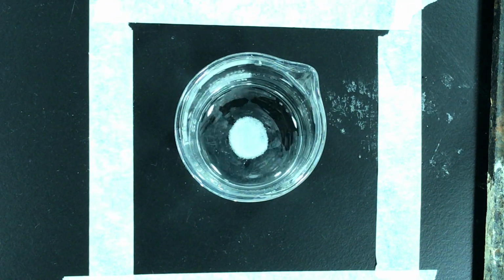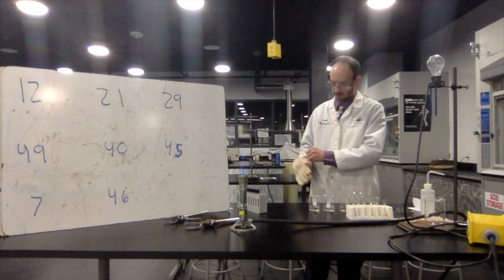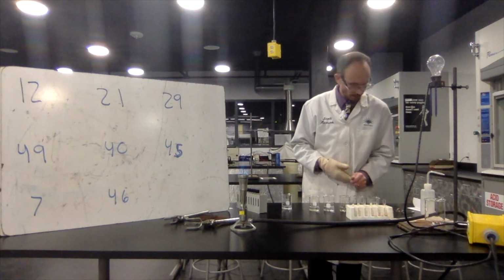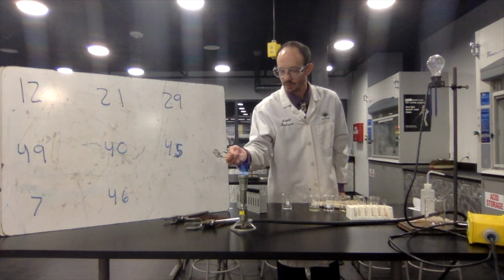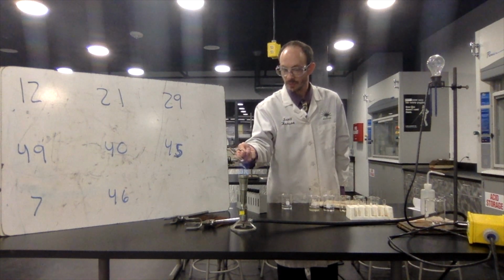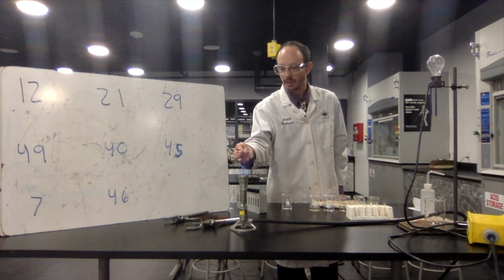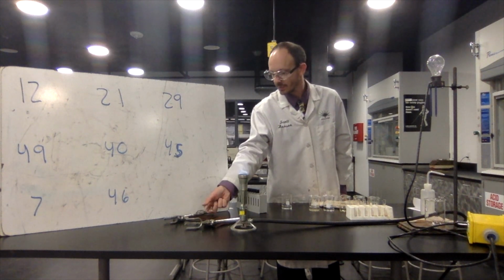So I put a little bit in there, and you can see we still have that same little bit in there. There's been no dissolving. I'm going to put on my glove, and nothing here at all. So now the last one is grab the material that we have and then pass it through the flame of the test tube to see if it actually melts. Now notice I'm not just sticking it in and going, because this is cold glassware and I want to bring the temperature up to the temperature of the Bunsen burner, but I am not seeing any melting at all inside of here. So I'm going to drop this first material off there.